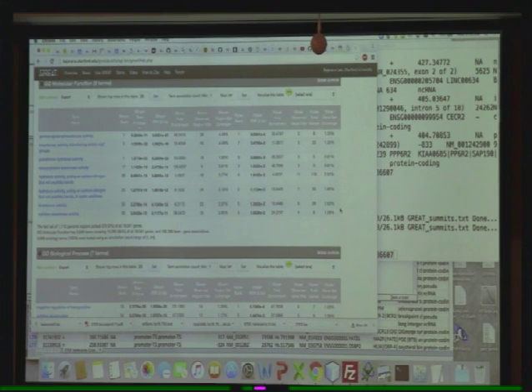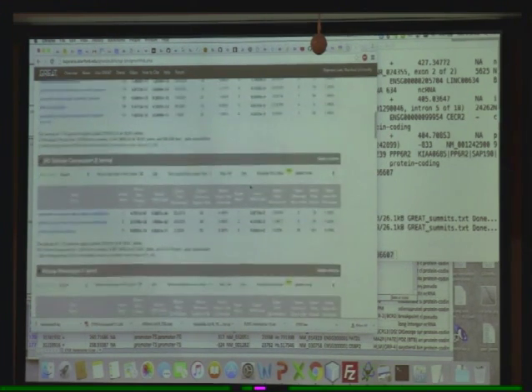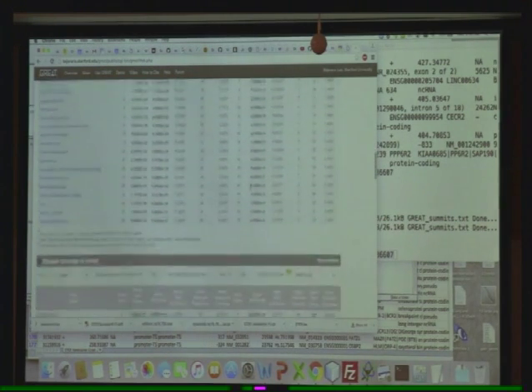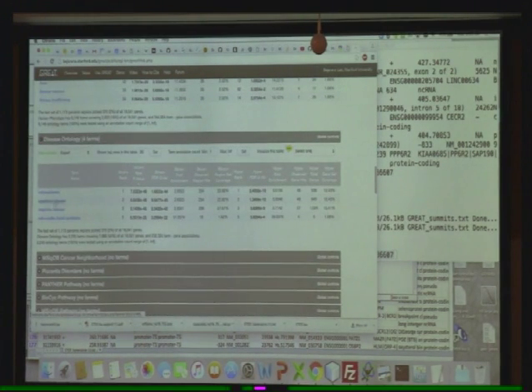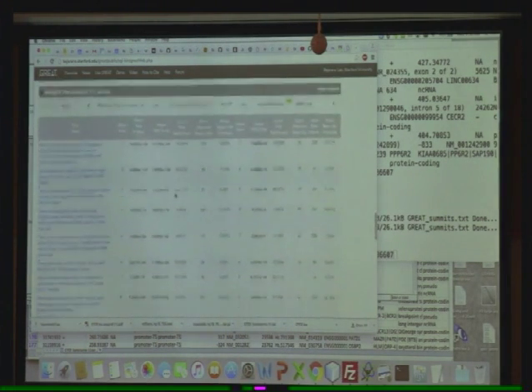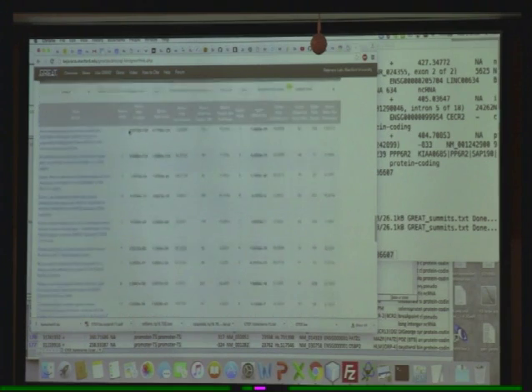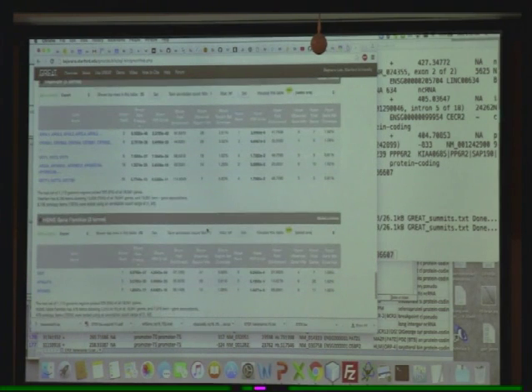Okay. So if you look again here, let's see if we get any schizophrenia coming out here. Anybody see any? Oh, right there. So disease ontology. So this is another way, but there's a ton of other things in here. Panther, MSigDB. It's just like a one-stop shopping thing for ChIP-seq if you want to annotate it. Perturbation. Here's some PubMed papers that have talked about it, the p-value.